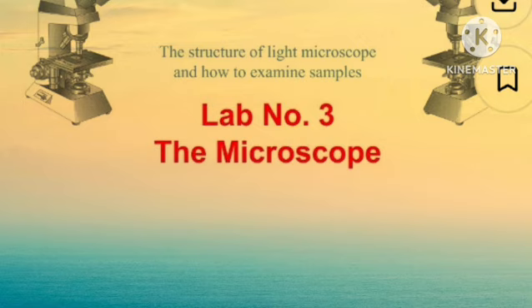And the second term, resolution. I already told you. In the next slides, I explain the types of microscopy and the terms involved in microscopy in detail. Please view each slide one by one. So resolution, what is it? The clarity and details.